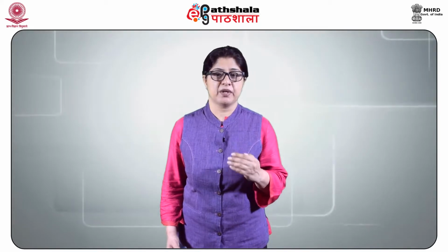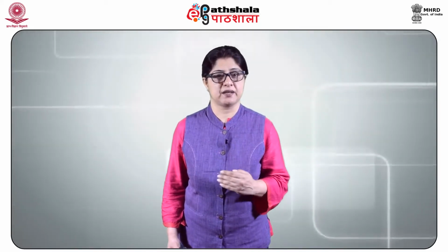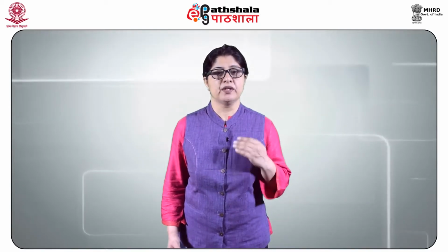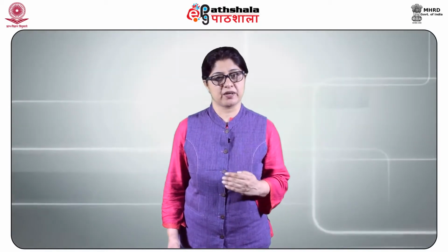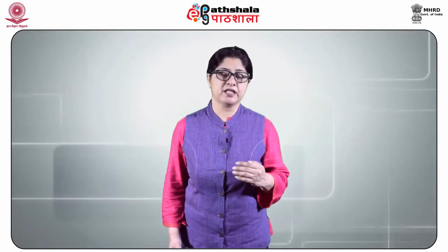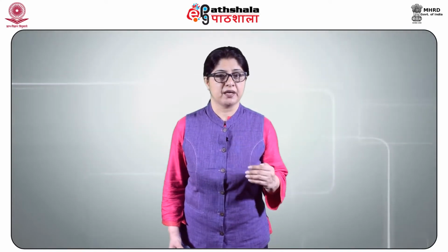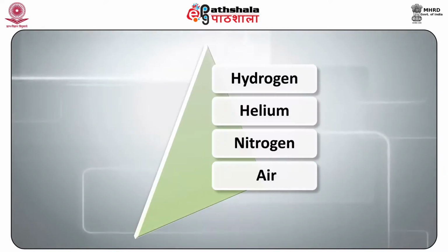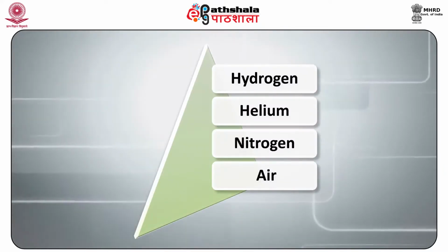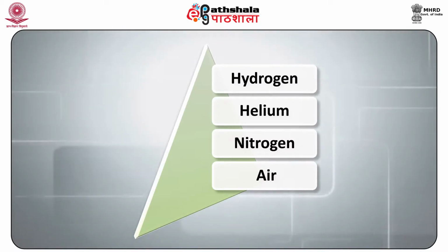The detector can be regarded as the brain of the chromatograph and the column as its heart. The details of the various components of the gas chromatograph are as follows. Firstly, the carrier gas. The carrier gas plays a vital role and varies as per applications. Carrier gas should be dry, free of oxygen and chemically inert. The most extensively used carrier gases are hydrogen, helium, nitrogen and air.